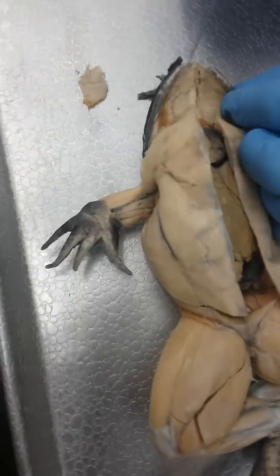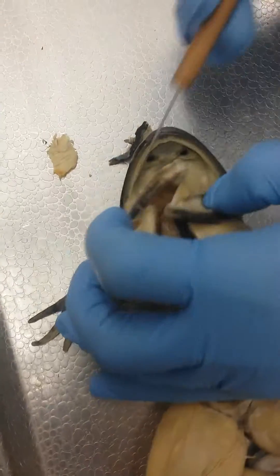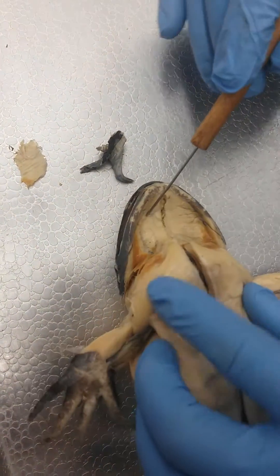We have a frog and these are the muscles. The floor of the mouth right here makes up the myelohyoid muscle.